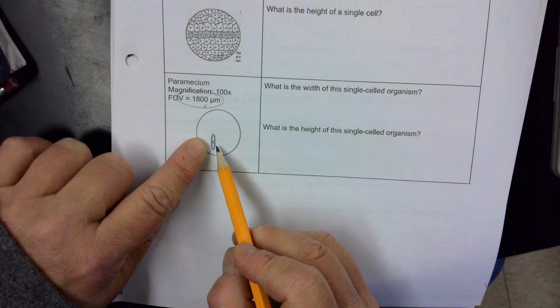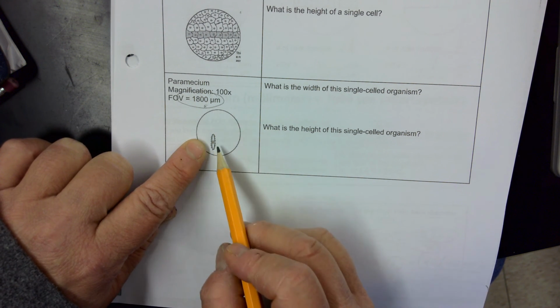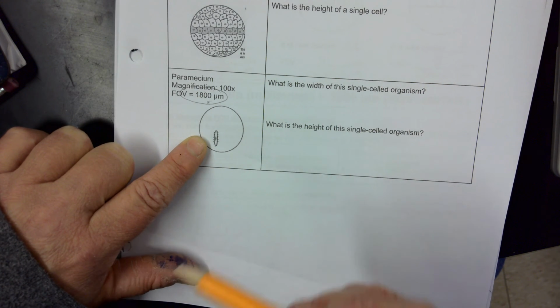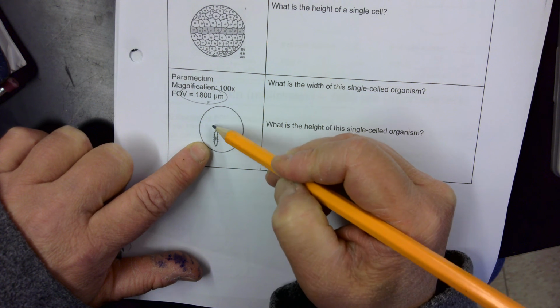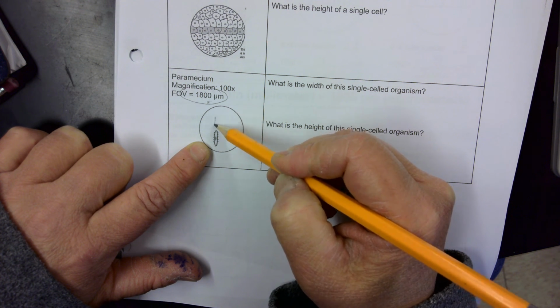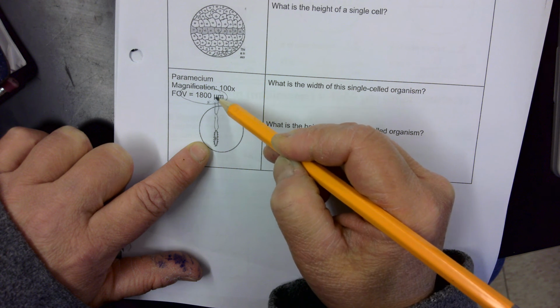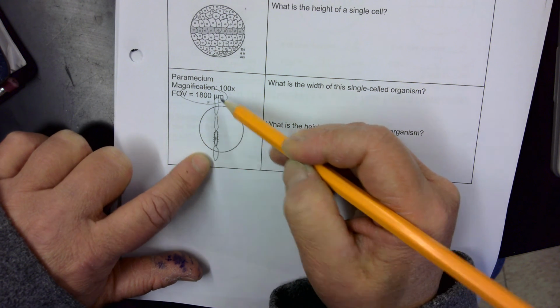But what you have to now do, if you can't actually see the cells all the way across, at least on this paper picture of this cell, what we can do to figure out what its height is, I'm just going to draw that structure as if there were ones stacked. And I'm just trying to estimate, trying to draw this structure over and over and over.